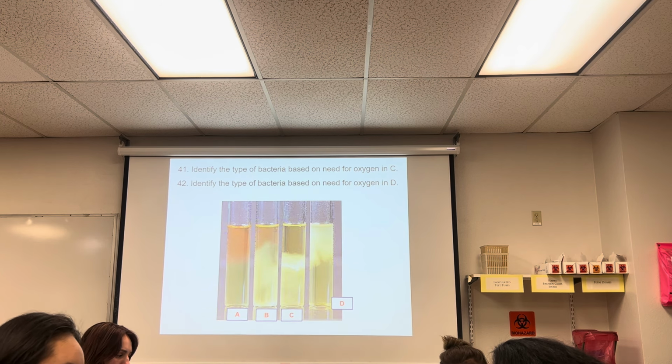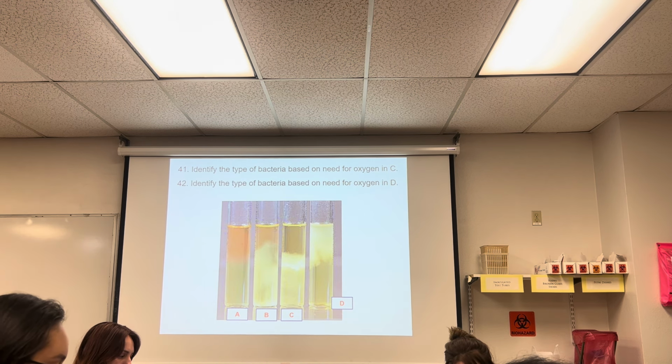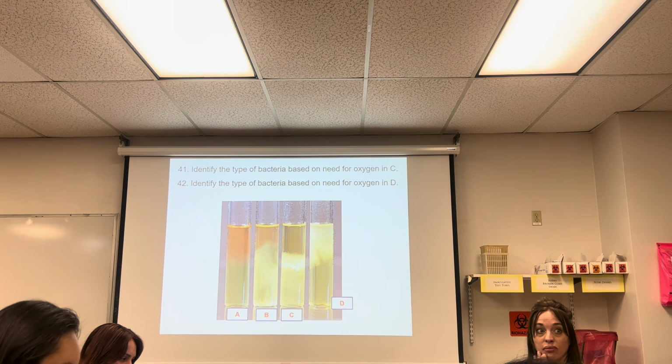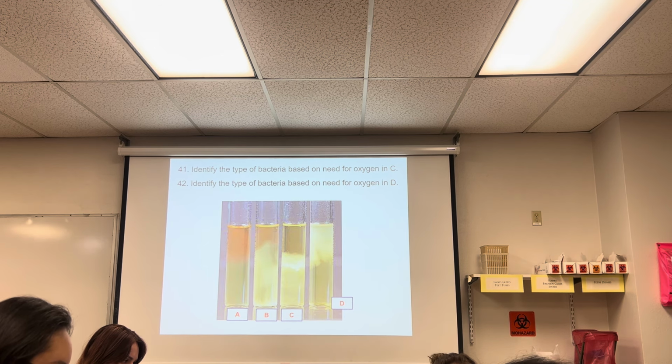Body temperature. But if I say, what's a permissive temperature in degrees Celsius? 37. First day of class. Okay? What if I say, where would you put plates where you want them to grow on the red tray? All of that is fair game. I might ask, name the 4 things that are in your personal drawer.